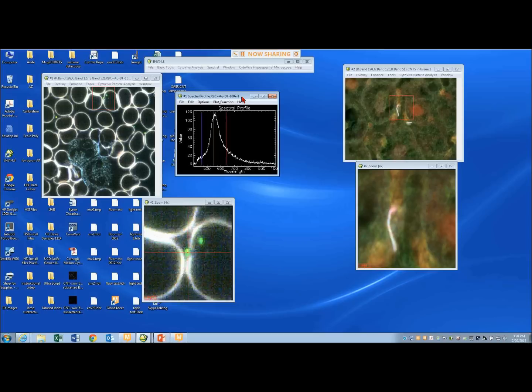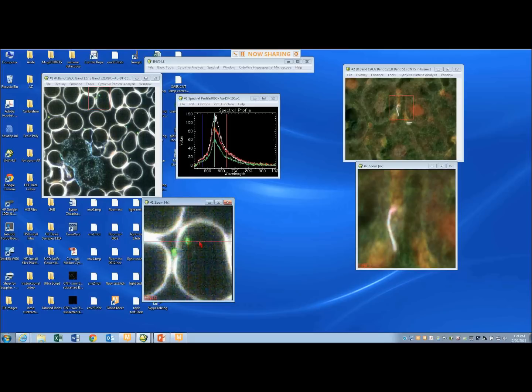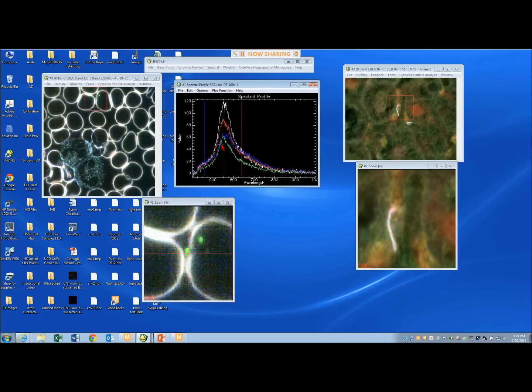The second example that we wanted to try to illustrate is the example of gold nanoparticles in a live red blood cell culture. Again, these are unlabeled live red blood cells that had been exposed to gold, and the sample was captured. And so in the zoom image you see here on the bottom with some pixelation, you can actually see where we've zoomed in, and this is showing the zoom area in the broader image, gold particles and live red blood cells. And as I click from pixel to pixel here in this image, you notice in the graph that we have here now in the center that we're collecting spectrum, and that this spectrum seems to be very homogeneous in nature, which it should, because the plasmon resonance effect of the gold in the cells should be highly repeatable, and in fact it is.